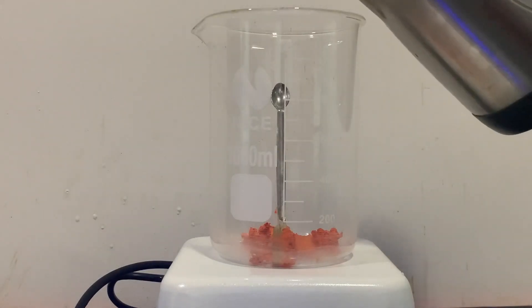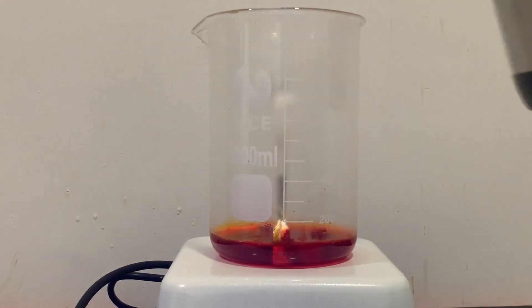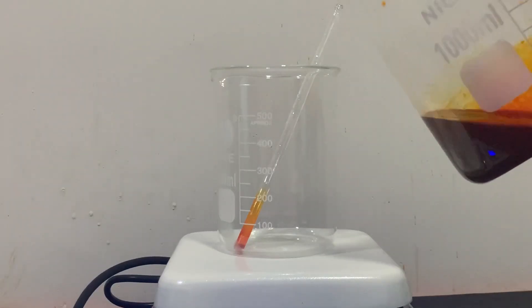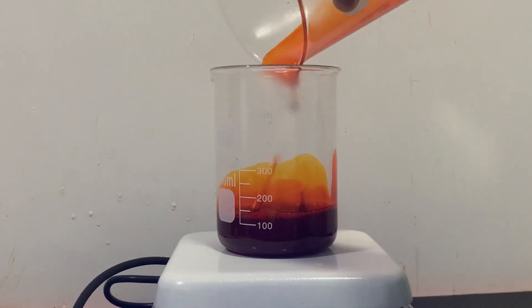The crude methyl orange is transferred to a beaker and is recrystallized with hot water. Once the methyl orange dissolved to form a solution, I poured the solution into a smaller beaker and left it in the freezer to cool down.